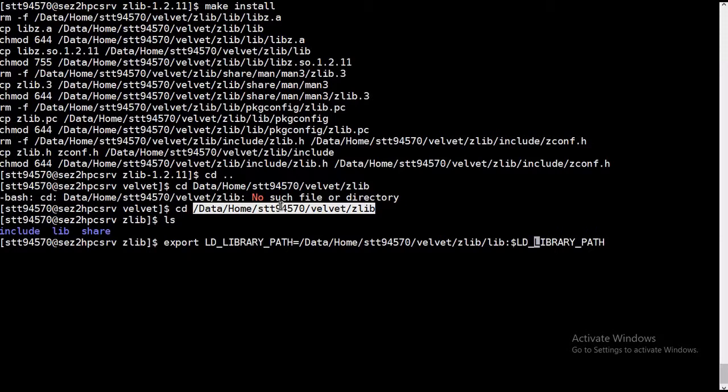Make sure you do not make any spelling mistakes over here, because the velvet will automatically identify the path, the include path as well.